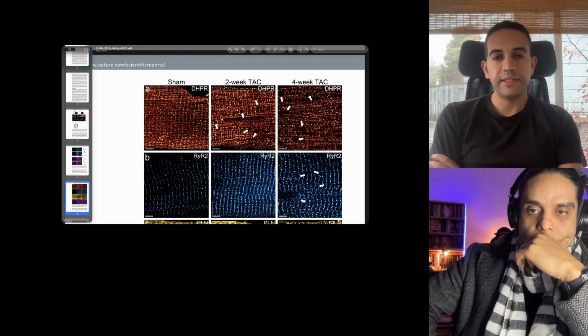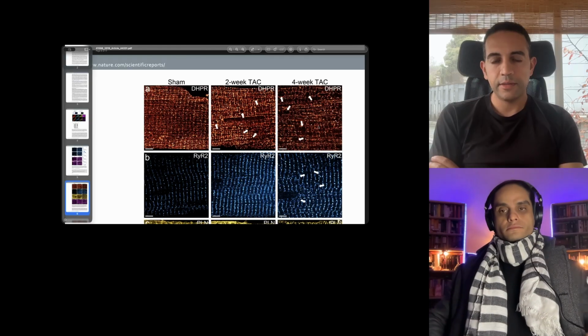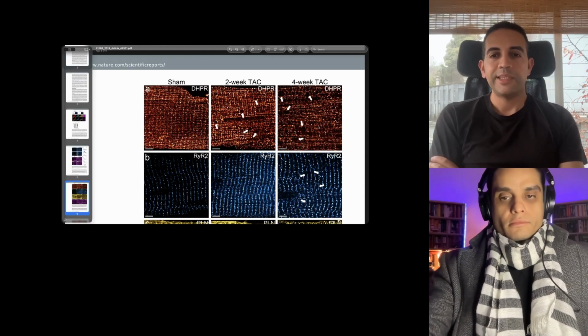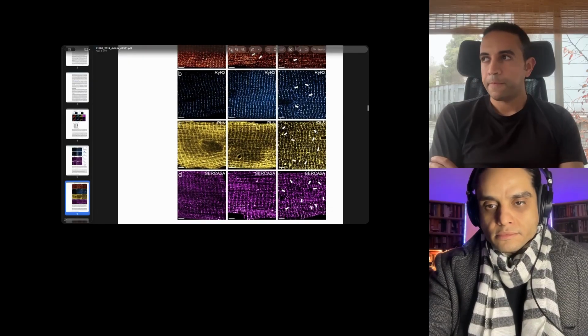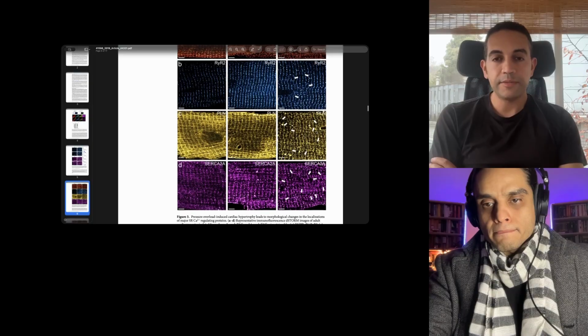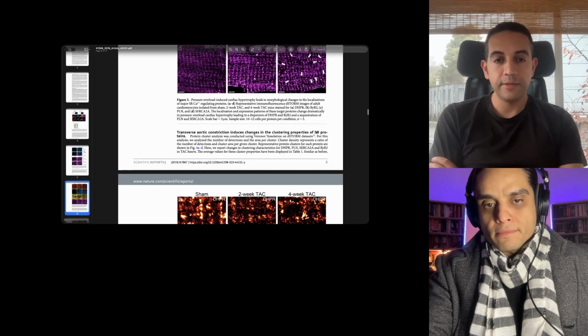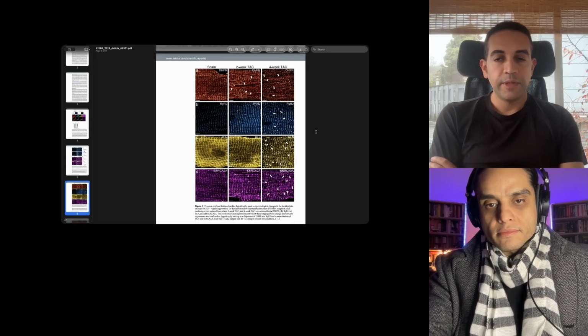And the way we quantify this in this paper is that we use this clustering method called Voronoi tessellation, which is an old mathematical method, first of all. So we're applying something really new to something really old. It's a way of dividing points where you're tracing a bisector to each and every nearest neighbor.